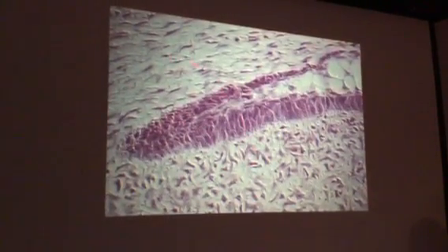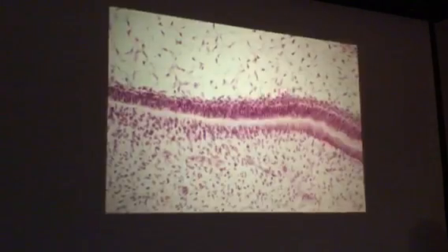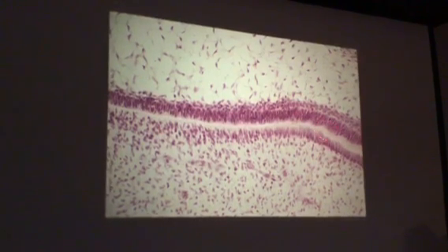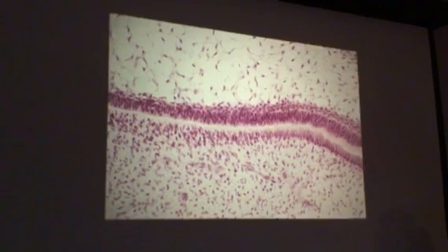Okay, how about this structure right here? Cervical loop. Okay, and these cells right there would be what kind of cells and in what stage? Ameloblasts. No, not organized. Well, yeah, organizing stage. Okay, because we have dentin, well, some predentin, but we don't have any enamel, so we'll say that those are in organizing stage.